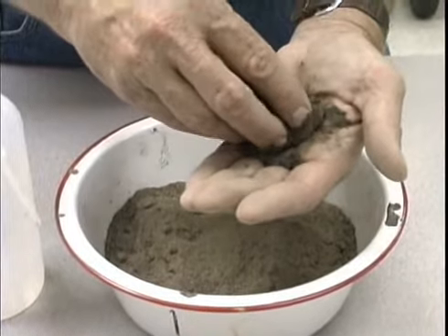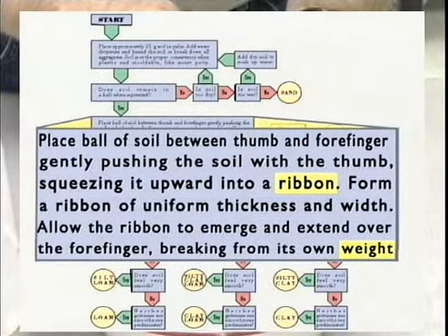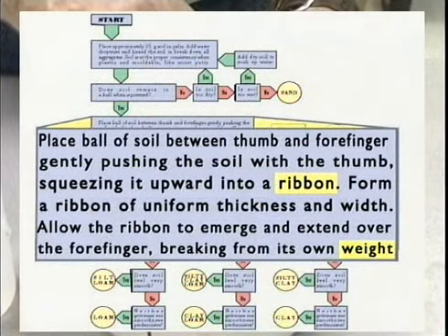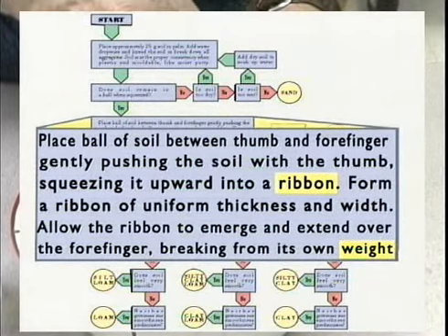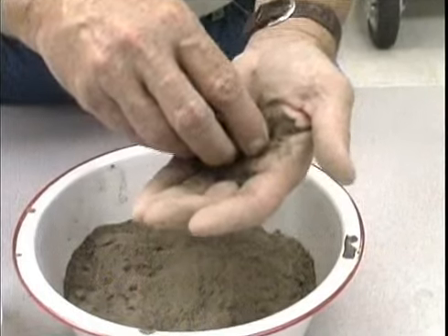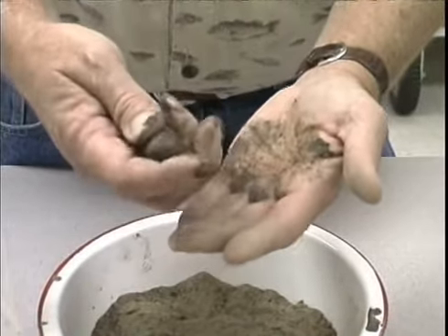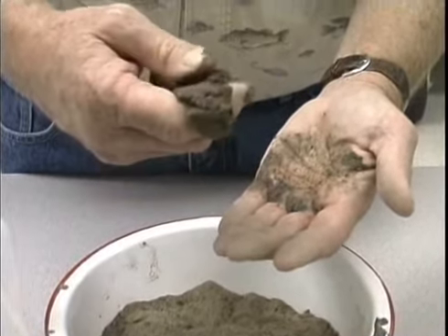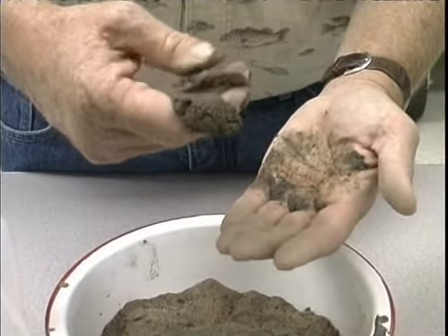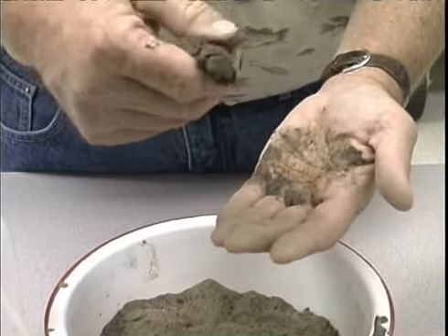As I read through my flow diagram, it says: does the soil remain in a ball when squeezed? If I squeeze this, it doesn't break completely apart or shatter totally, so it does have some ability to form a ball — my answer is yes. The next box says: place the ball of soil between the thumb and forefinger, gently pushing the soil with the thumb, squeezing it upward into a ribbon of uniform thickness and width, allowing the ribbon to emerge and extend over the forefinger, breaking from its own weight. I'm squeezing it up between my thumb and forefinger and it breaks and falls off — it does not have enough clay in it to have the ability to ribbon.